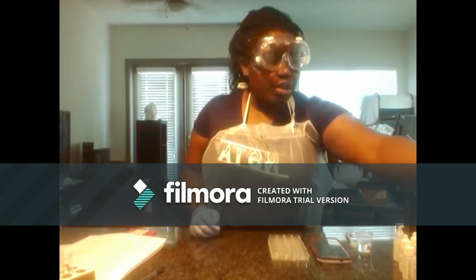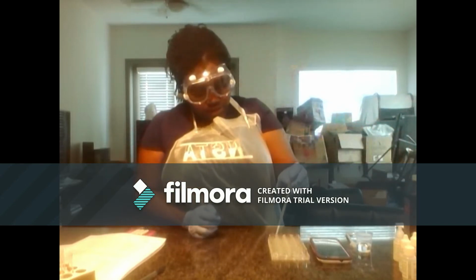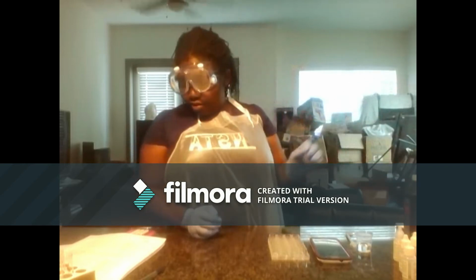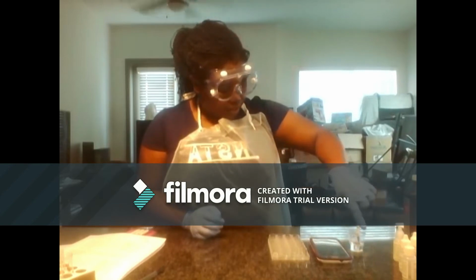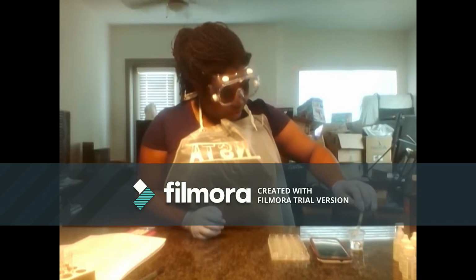I have purified water, and 0.4 mLs of hydrogen peroxide. Okay, so I'll add the hydrogen peroxide and start.